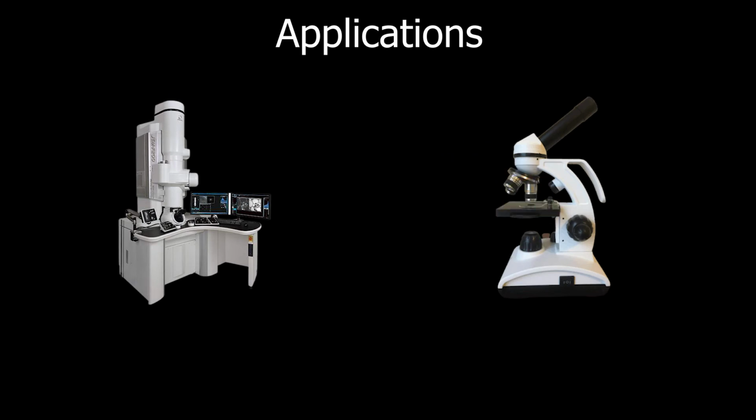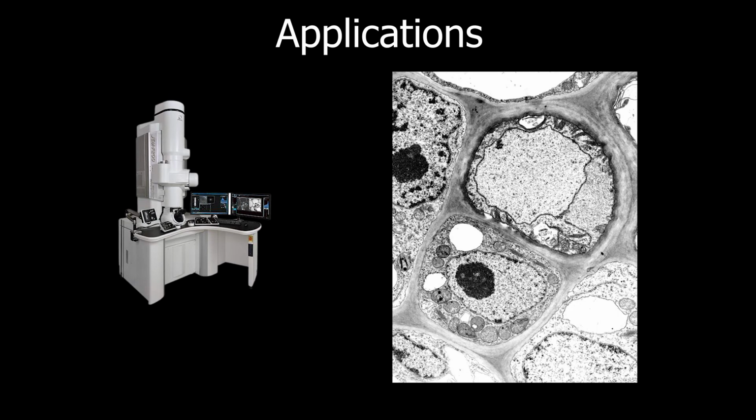TEM is particularly useful in examining the inner structure of the samples: detailed cellular structures and single molecules or atoms. TEM is particularly useful in material science and is particularly useful when dealing with non-living samples.